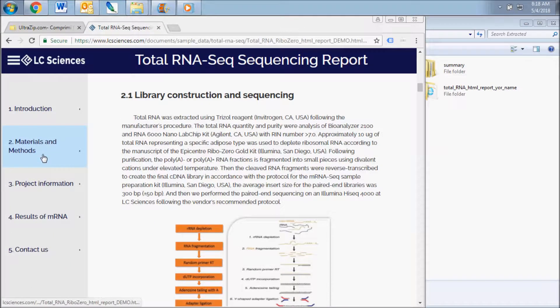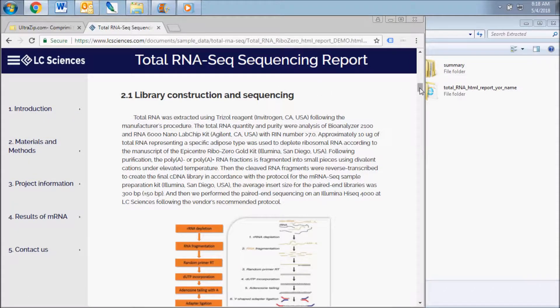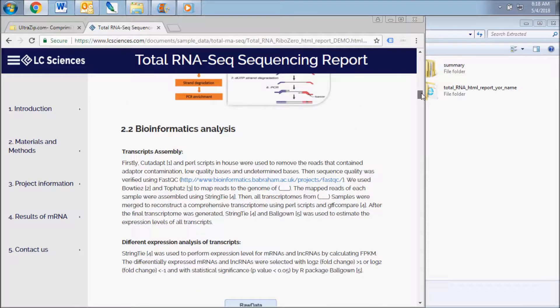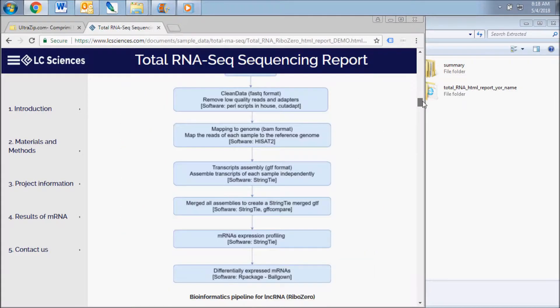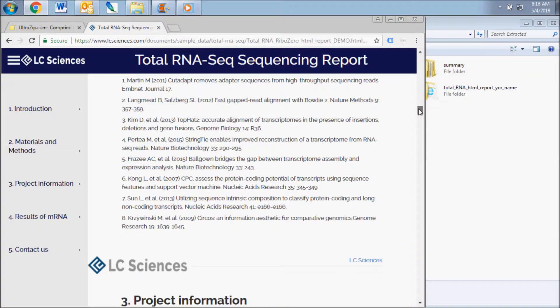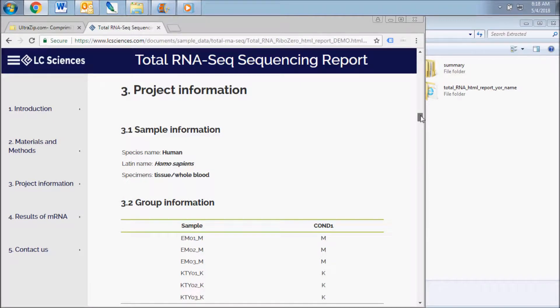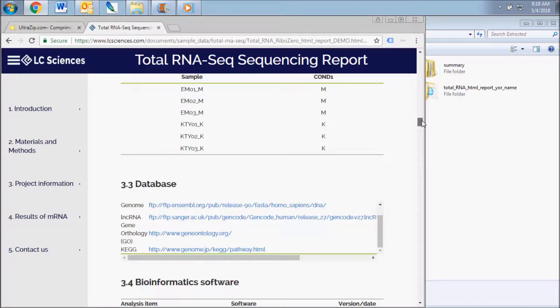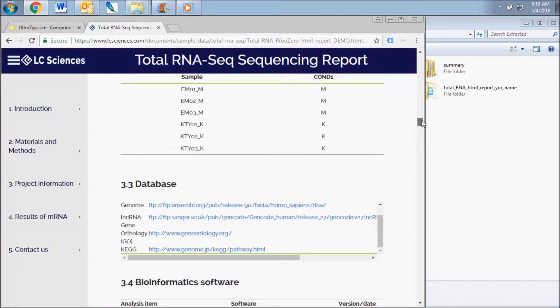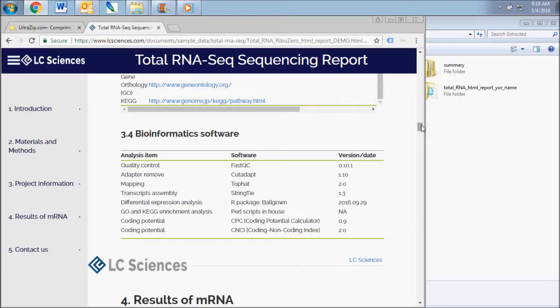The first report section contains general information about the methods we use to complete the library preparation and sequencing of your samples and the bioinformatics pipeline used for analysis of your raw data. The next section describes the details of your project, your samples, the databases used for sequence alignment, and the specific software used for the data analysis.